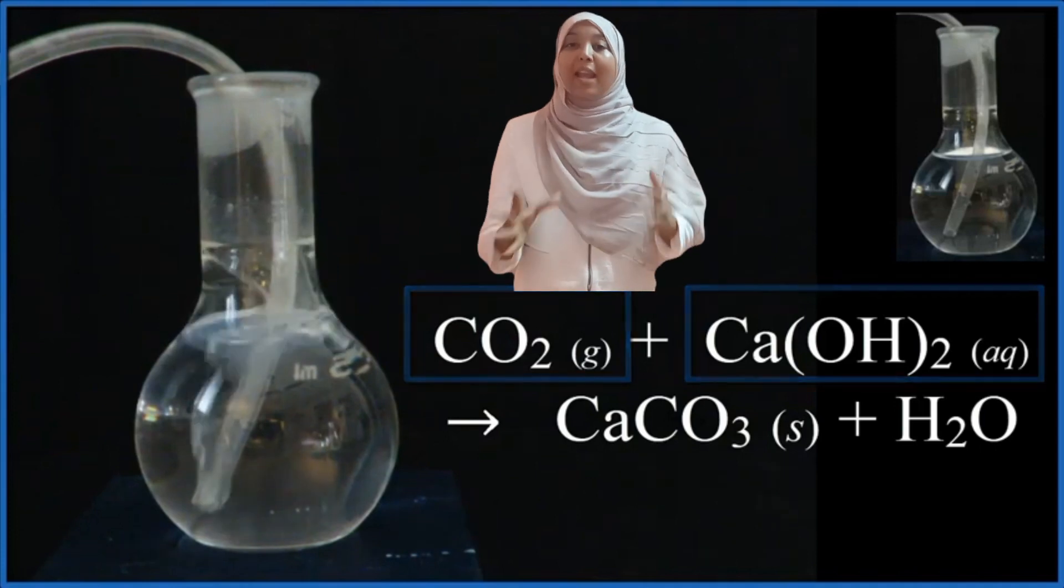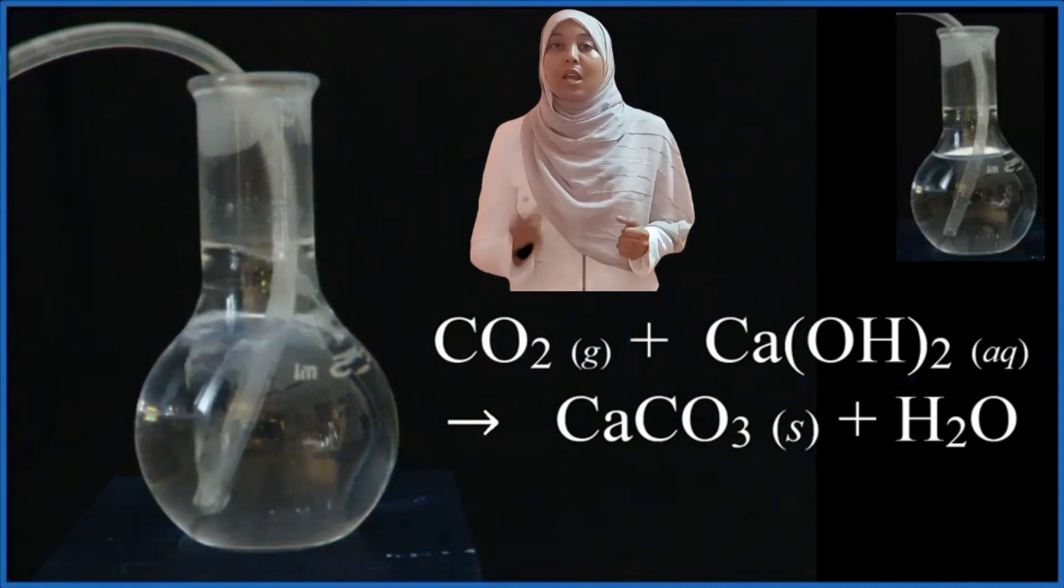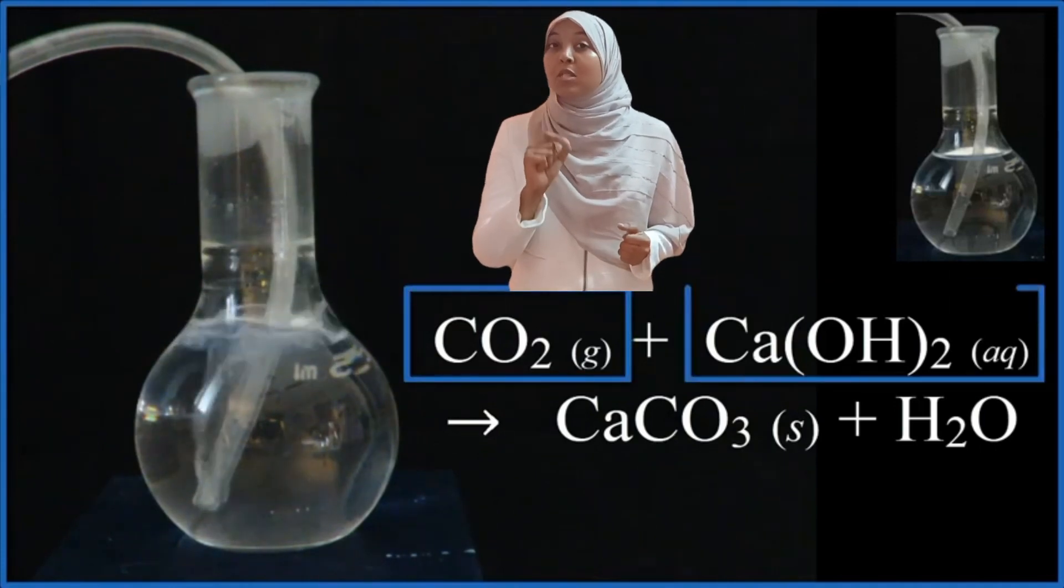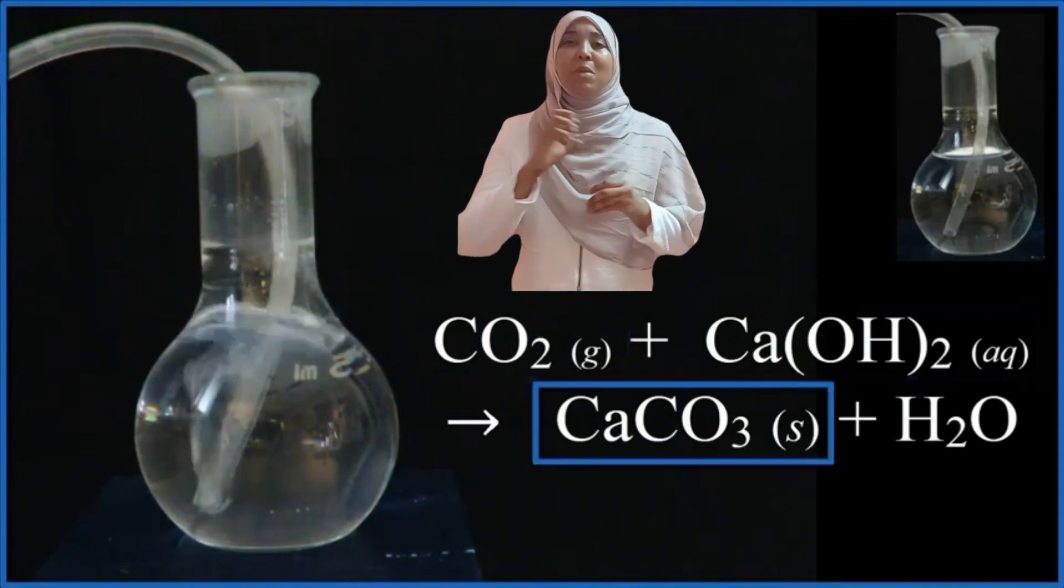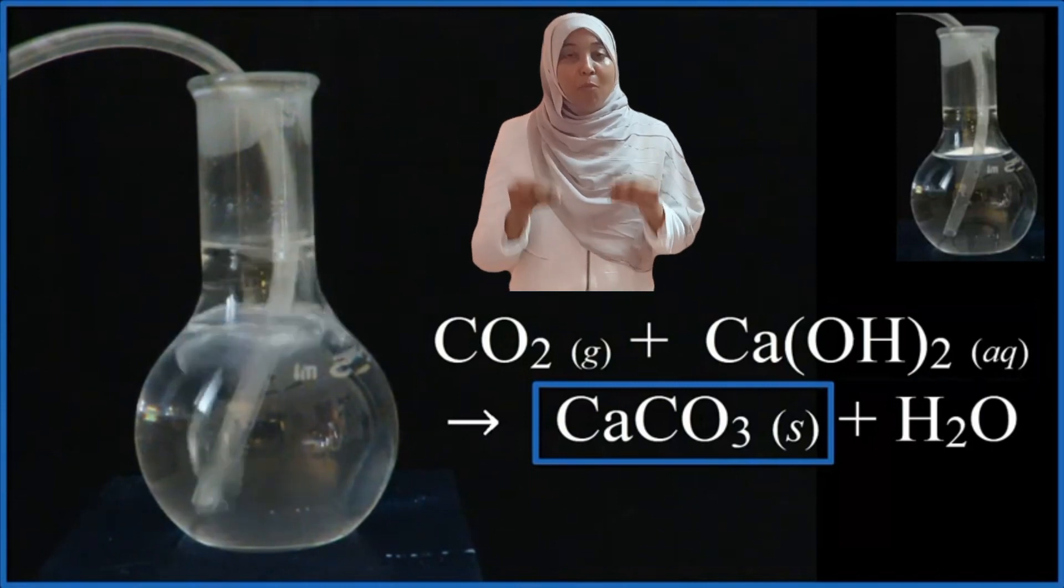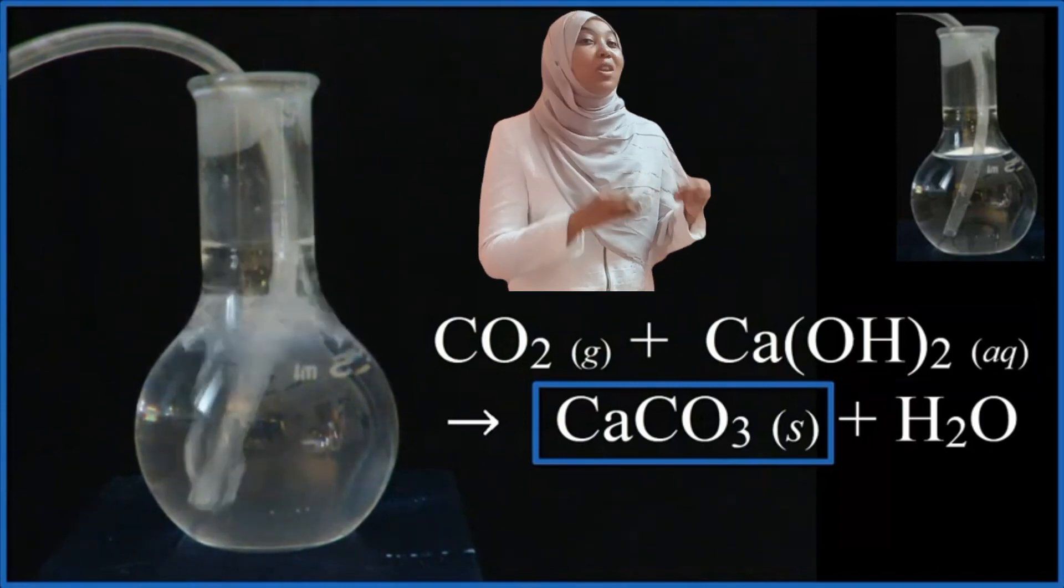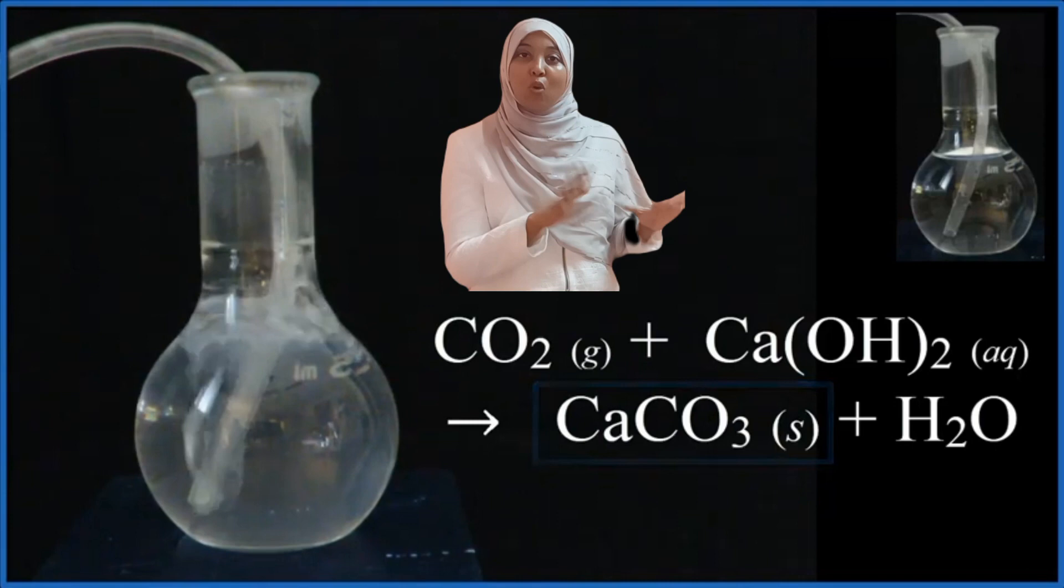A point of note is this: some books might refer to the formation as a cloudy or milky one. Don't worry—it's the formation of a white precipitate with calcium hydroxide, and look at what is happening: a white precipitate has been formed.